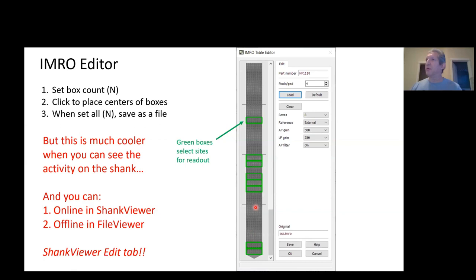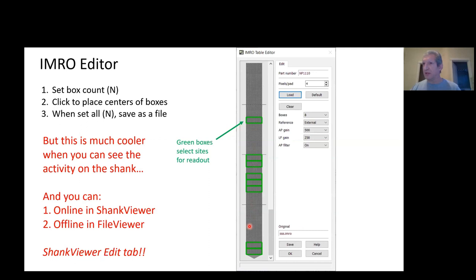It pops up a graphical site selection dialog that looks like this. It's pretty simple to use. You have 384 sites that you have to program, or 384 readout channels. For example, you might choose N boxes to put down where, let's say, N is 4. In that case there'd be 96 channels in a box. These green boxes are where you're selecting sites. You just click on the probe and it puts down a box, and those are the sites that you're going to read out.